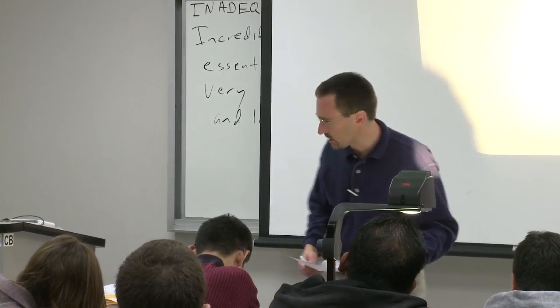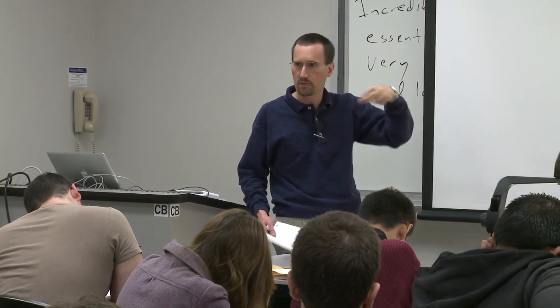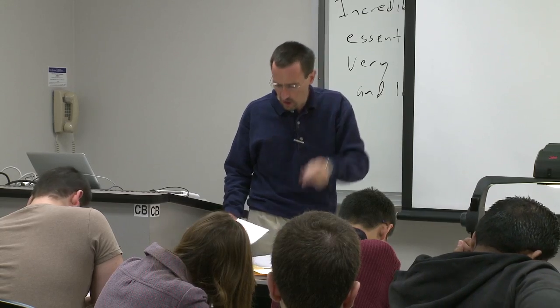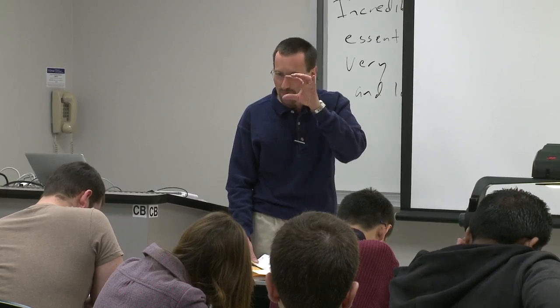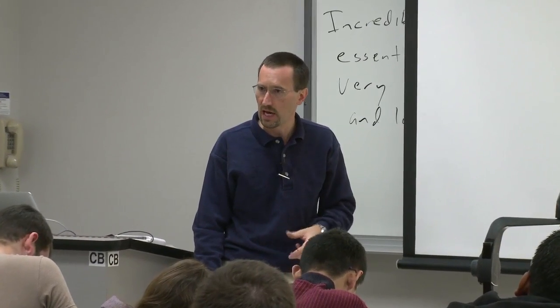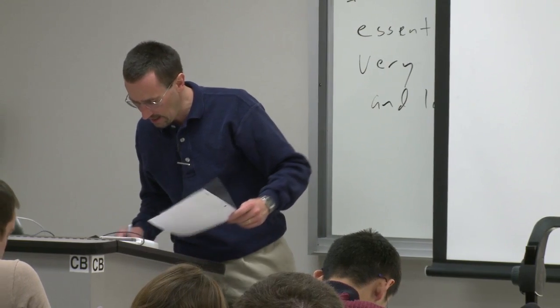So one of the frontiers in NMR right now is really small probes and probe volumes so that you can concentrate your sample in a very small space and get enhanced signal-to-noise ratio with small samples. In a way, a 5 millimeter NMR tube, what's sort of this typical standard, is a big sample in the sense you're putting a lot of milliliters in there, but it's a very convenient size for preparative chemistry. It's just that by the time you're dealing with a really late stage intermediate, say in a long total synthesis or a natural product, it may not be enough.